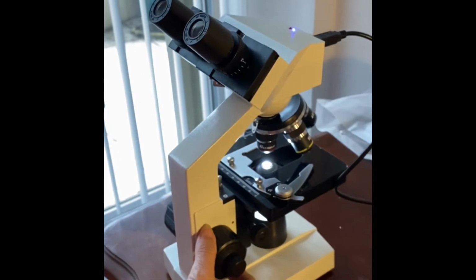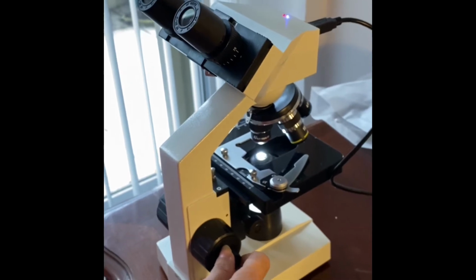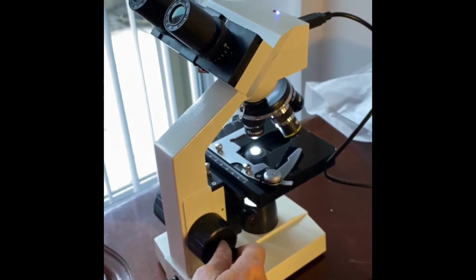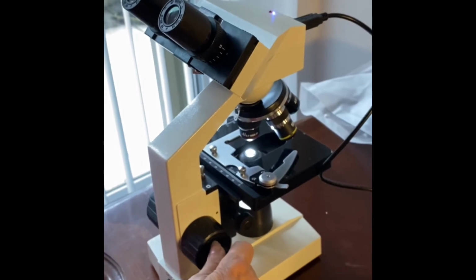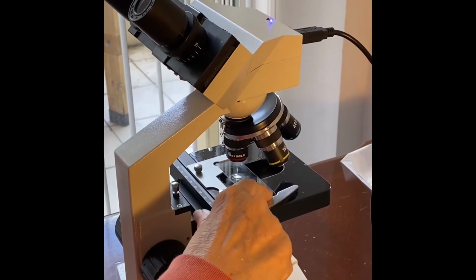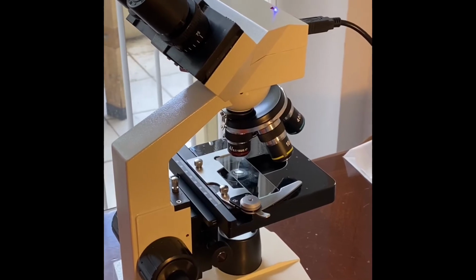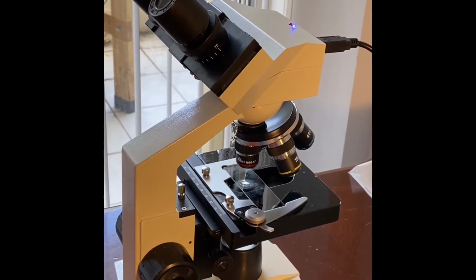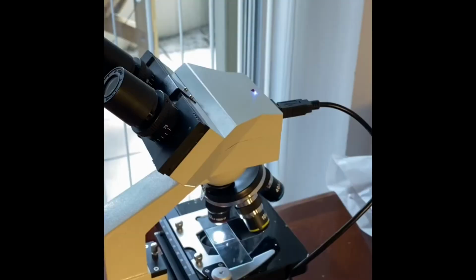It will initially become focused, but not totally, and that's where you depend on the fine adjustment, which is on the outer edge of the microscope, and you just tune it in very, very little. So your slide is here with the permanent specimen, which you will use in this activity, a letter E. It's going to be a wet slide.